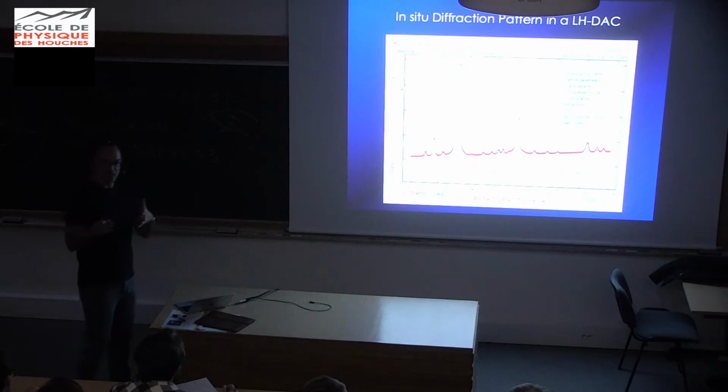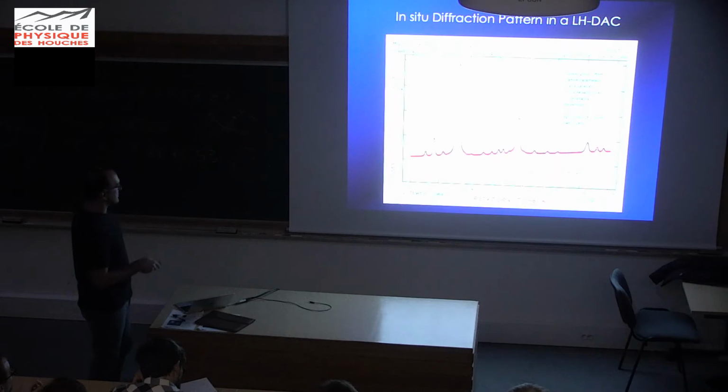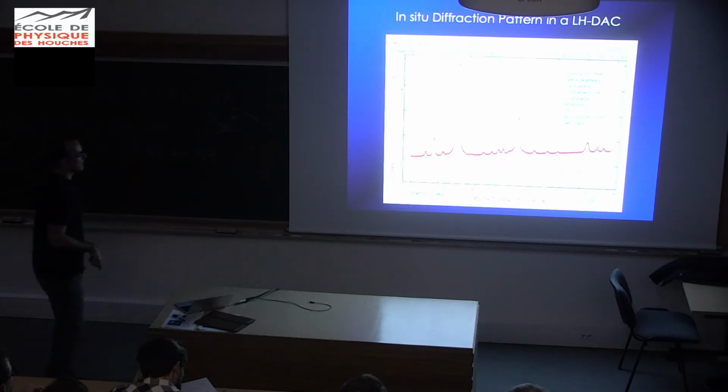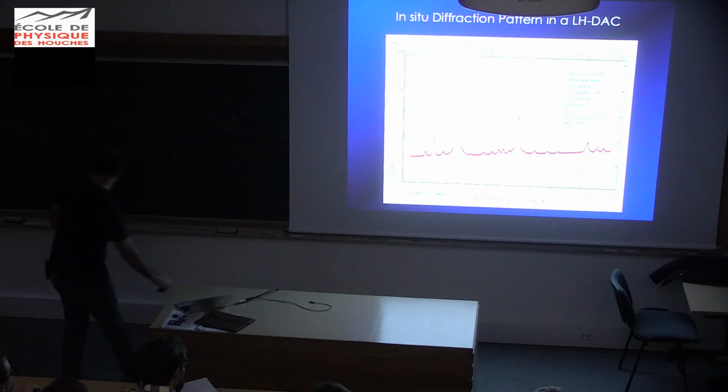And if you know the composition and you know the size, you know the volume, then you know the density, all right? And this is how you measure the density. This is MgSiO3, which is Bridgmanite at that temperature. The pressure is 80 GPa. This is a 2, not a 1. 2681 K. And these are the lattice parameters. So you know what the lattice parameters are, right?